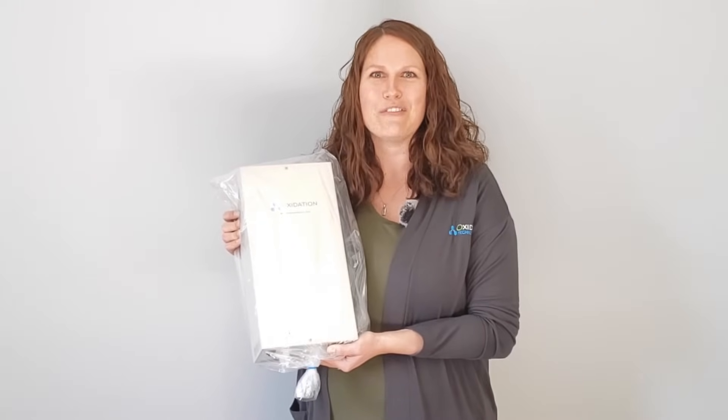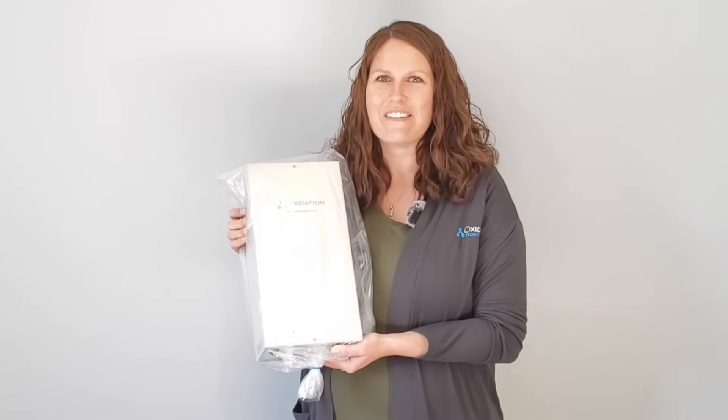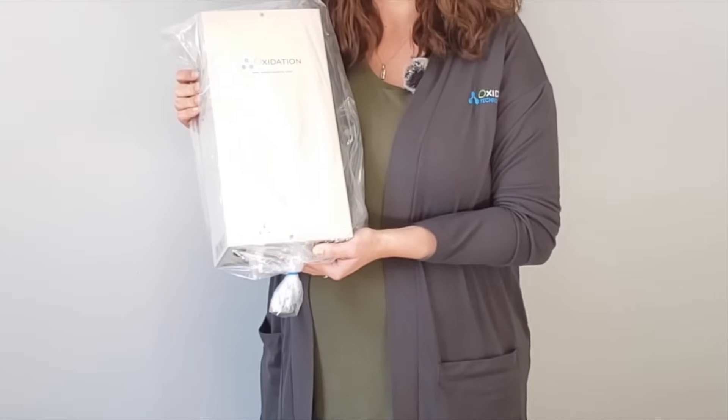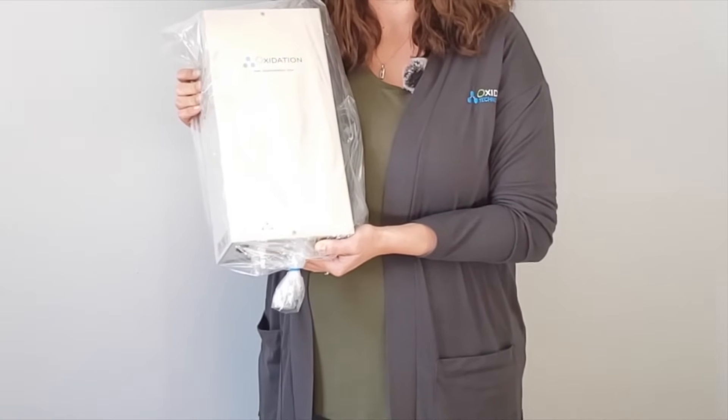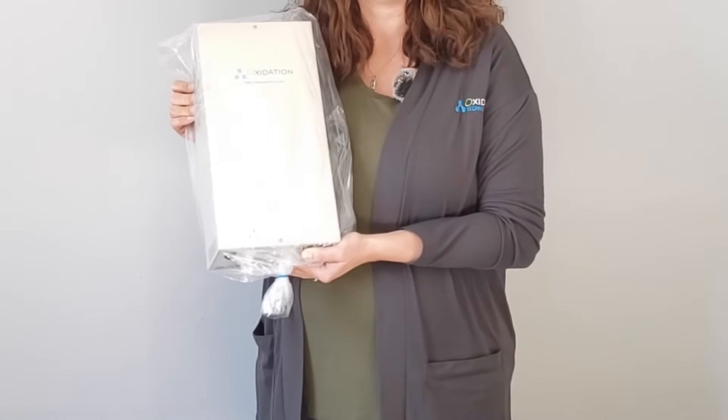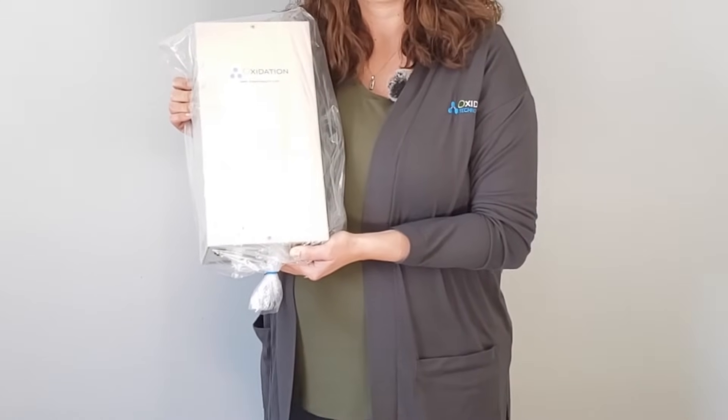This video is going to describe the main features of the HTU 500 ozone generator. This ozone generator will produce 1 gram per hour of ozone from only 0.75 liters per minute of oxygen. This is a great turnkey ozone generator that can be used for a variety of applications such as ozonated olive oil, lab use, and even odor removal. There are lots of uses for this great little HTU 500 ozone generator.